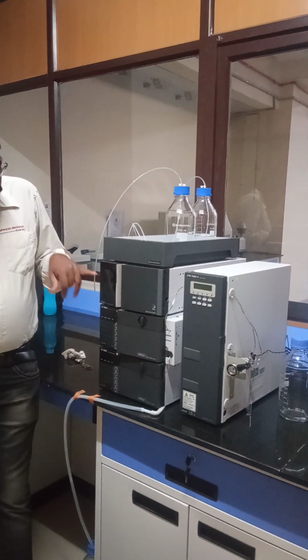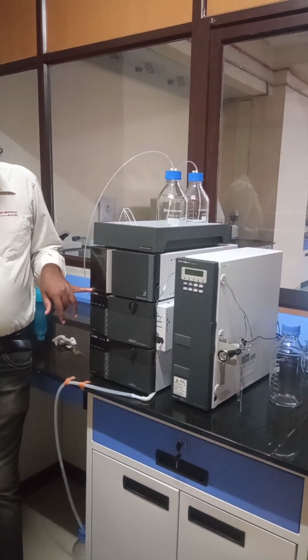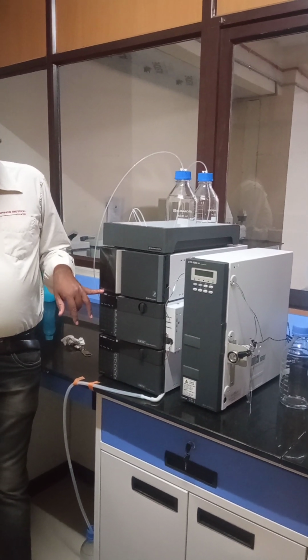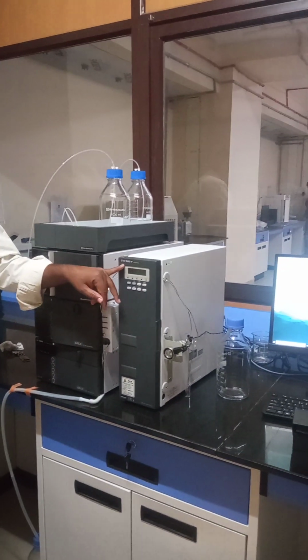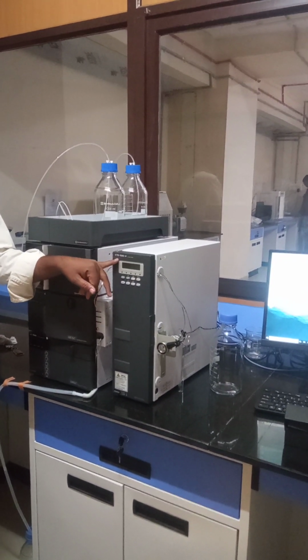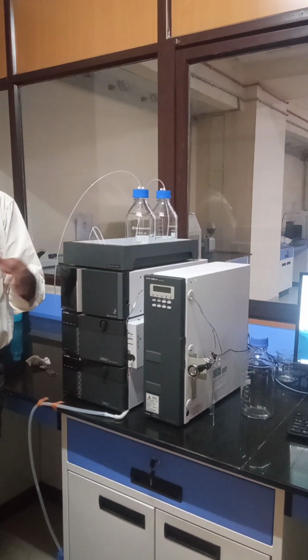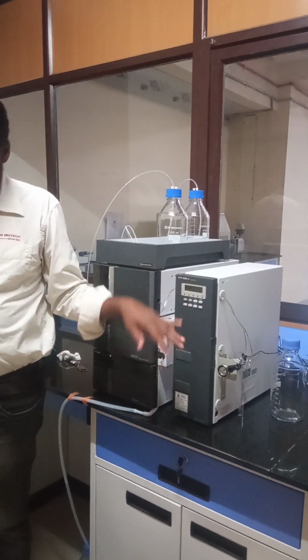Next, CTO-10, this is the Shimadzu model code, not a specific code. CTO-10ASP column oven.